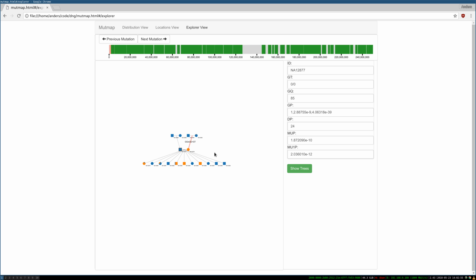Hi, this is Anders Pittman, and I just wanted to do a quick little screencast to demo some of the stuff, the visualizations we've been working on for this DeNovoGear prototype visualization tool.